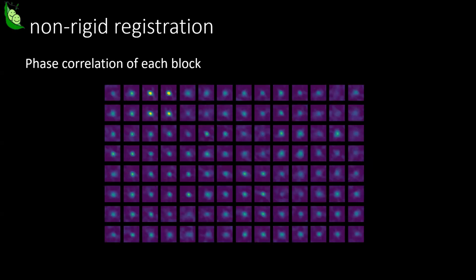So these correlation maps, you can see there's this peak here, and we could take the peak, just the top pixel, but you could also fit an interpolation to that. And in our case, we use kriging interpolation and take the peak of this interpolated value, and that will give you a subpixel shift, so you're going to have pixel shifts that are potentially more accurate because you could do a shift of 0.1 rather than 1 pixel and so on.